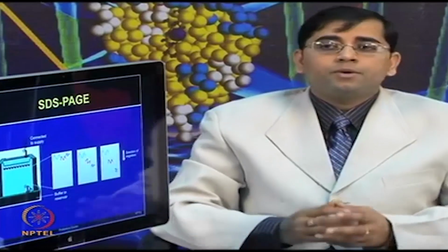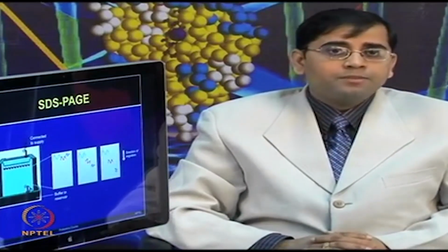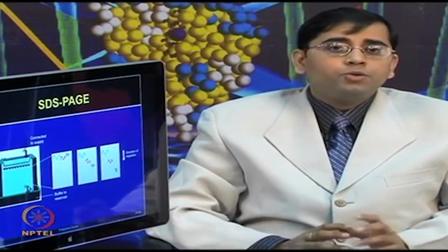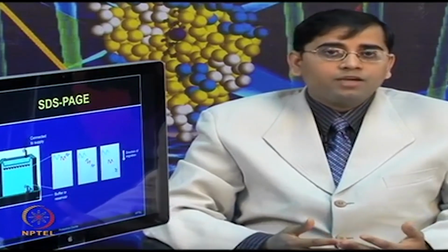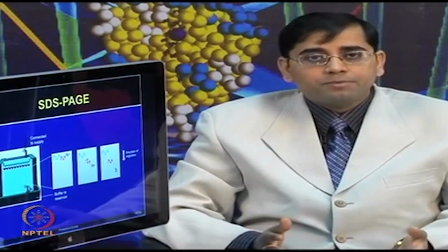Since we are talking here about the two-dimensional gel electrophoresis workflow, I think it is important to clarify that in 2DE, when you use SDS page, you do not need to make these wells by adding a comb, because you already have a flat IPG strip which has done the first dimension protein separation.